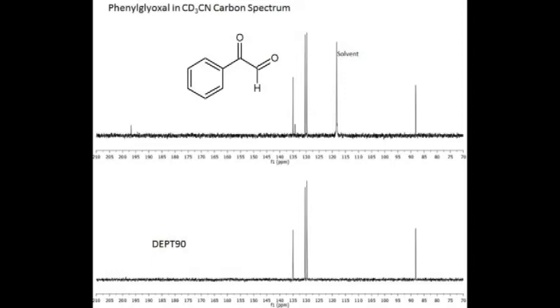Now, an aldehyde is the only carbonyl functional group that has a proton right on the carbon. And so aldehydes show up in DEPT 90s. They show up very nicely. The fact that that carbon is missing means it cannot be an aldehyde in there. Maybe a carbonyl, but it's not an aldehyde. And then the peak at 87 ppm. It's nice, it's tall, it is a CH.